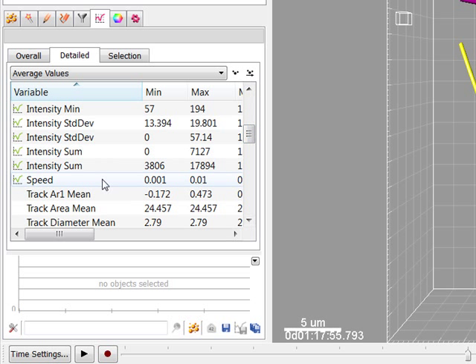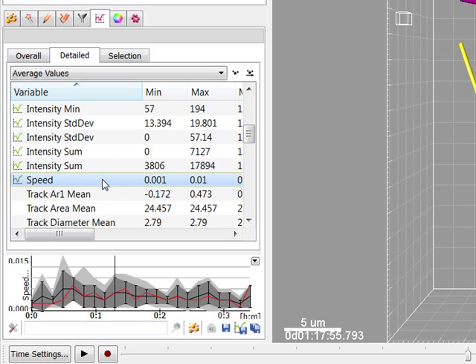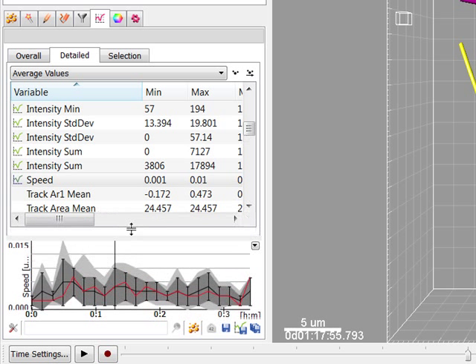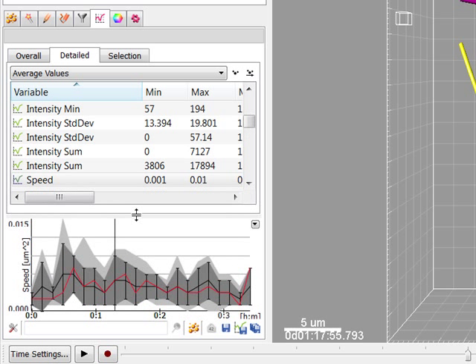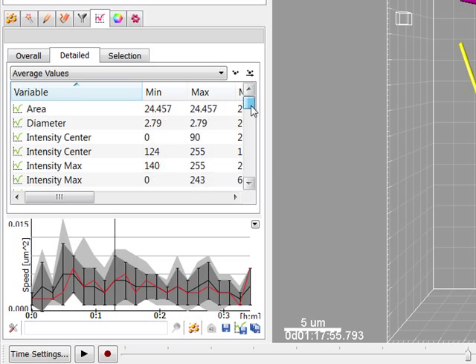Every average value in the plot is represented by a colored line or range. The black line indicates the mean value and the red indicates the median. The range between the minimum and maximum values is shown as the light grey area, while the dark grey region labels the standard deviation range with error bars.